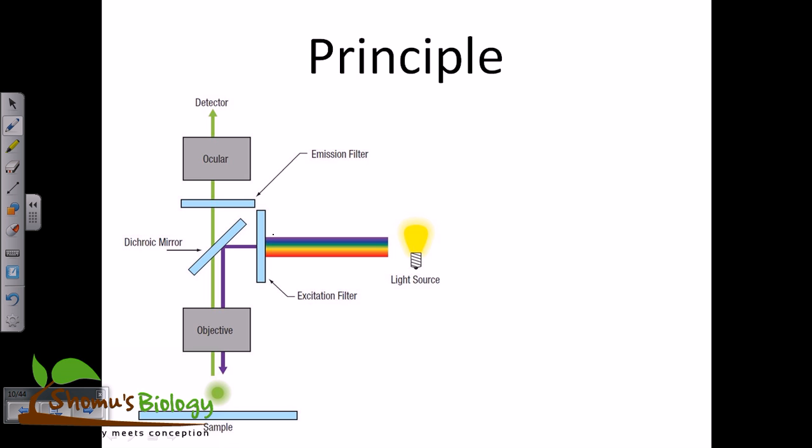So the important thing here is, for example, let's say this is the sample or the specimen that we have in the slide, which is fixed, and which contains a chemical compound that shows us fluorescence. Those compounds are called fluorescent molecules, for example fluorophores. Quinine is an example of such a chemical compound, which emits fluorescence light. Or GFP, green fluorescent protein, which can be labeled onto different proteins or constructs inside the cell to visualize them with the fluorescence microscope.